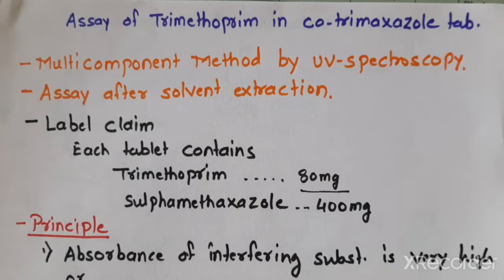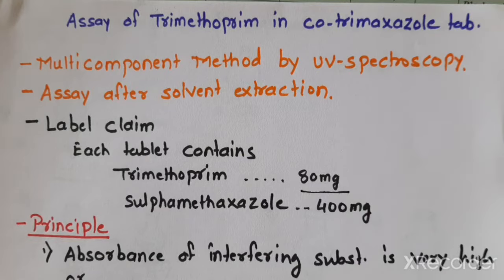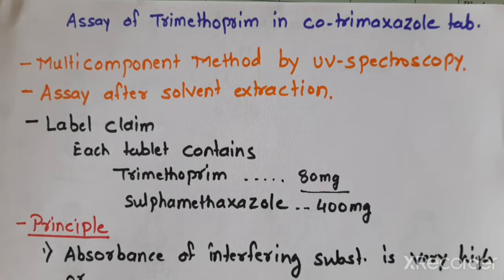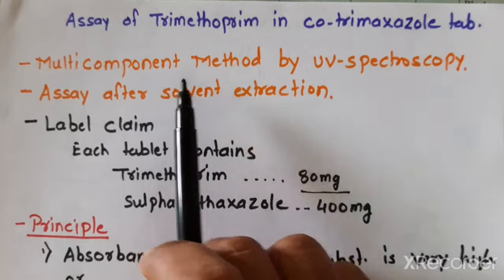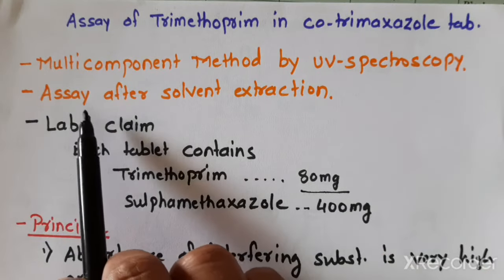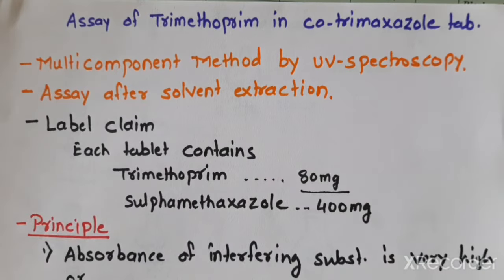Hello friends, in this video lecture we will be demonstrating the assay of trimethoprim in Co-trimoxazole tablet. We have already studied various methods of multi-component analysis using UV spectroscopy. One of the important methods is assay after solvent extraction.